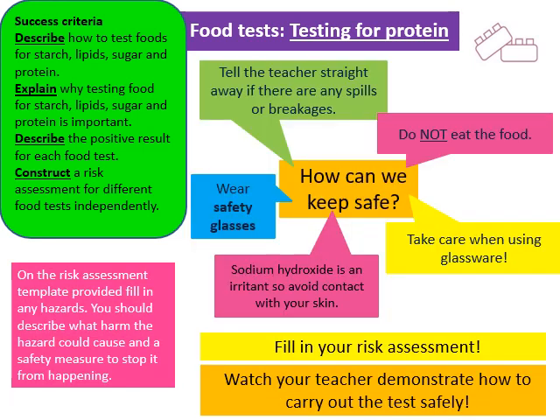As with the other food tests, I've given you some key things to think about when we're thinking about how we can keep safe. I'd like you to do the same as before and complete your risk assessment template for this food test. So make sure that you are identifying any hazards, you're describing the harm the hazard could cause, and any measures you can think of to help stop that from happening.